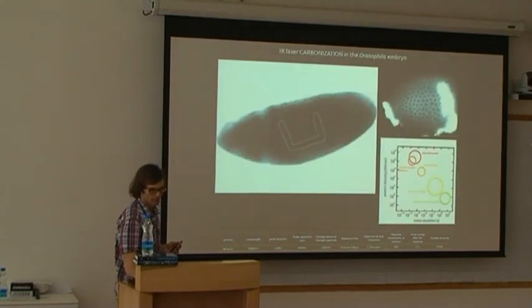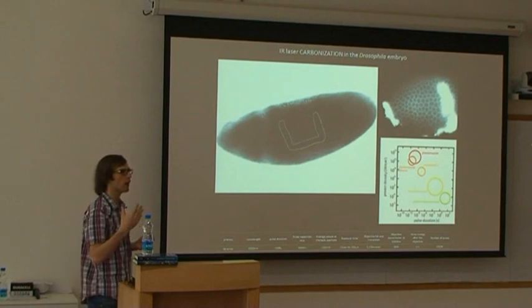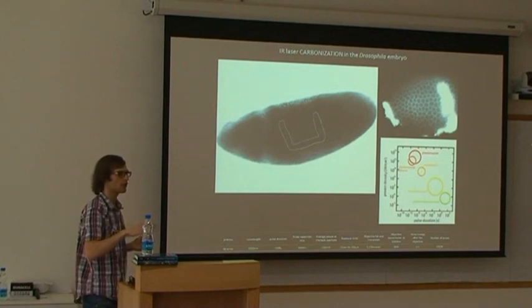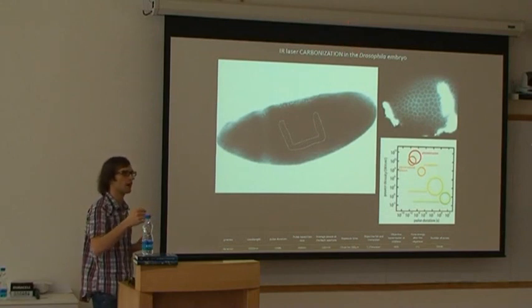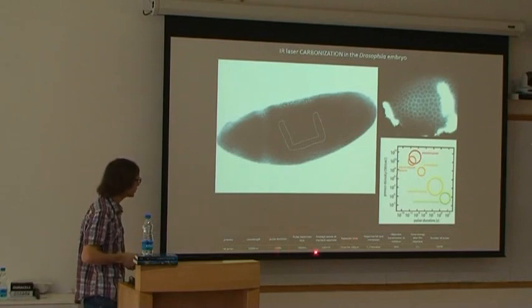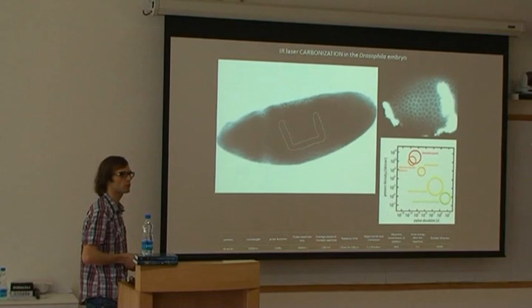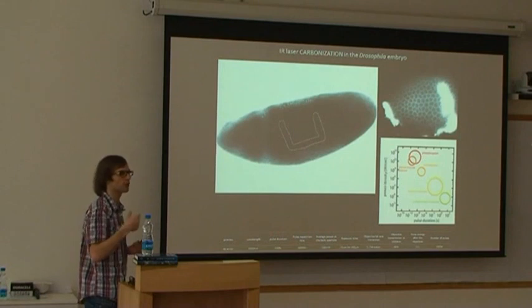So this, I think, will be the last example I will give you. It's something that I've been doing recently. It's a new way of using the laser to do another type of ablation. This is called carbonization, and as you learned before, this is a thermal effect, a laser-tissue interaction. So what I do is lower the power much compared to plasma ablation, and this will introduce much more thermal effects.